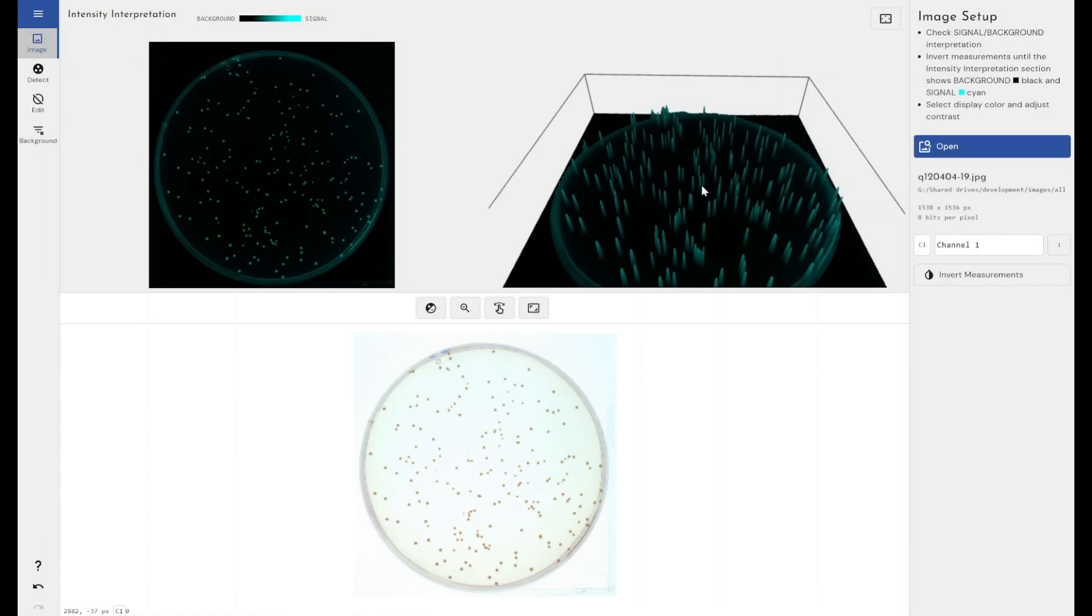This is the image view. What we have at the top left here is a representation of how the software is seeing the image. What we want to see is our signal, the things that we're interested in measuring in this lovely teal color here with our background being represented as black.